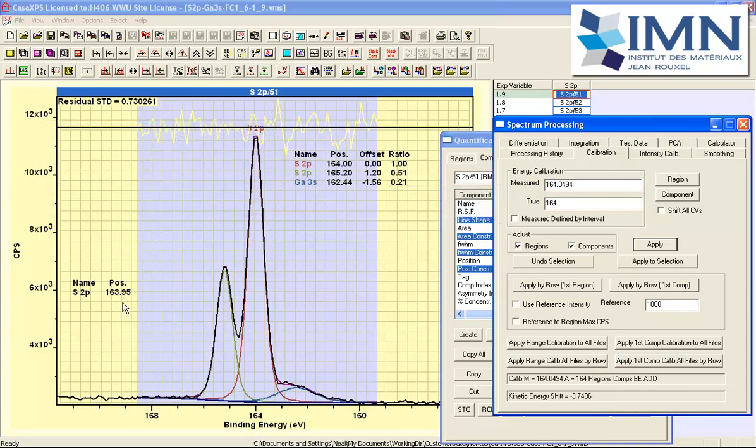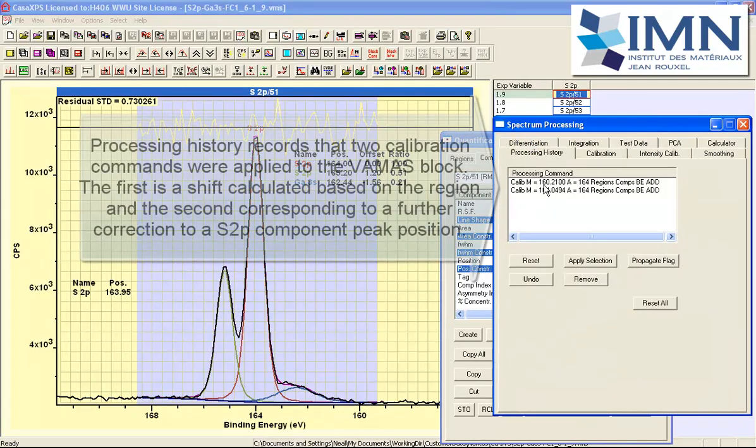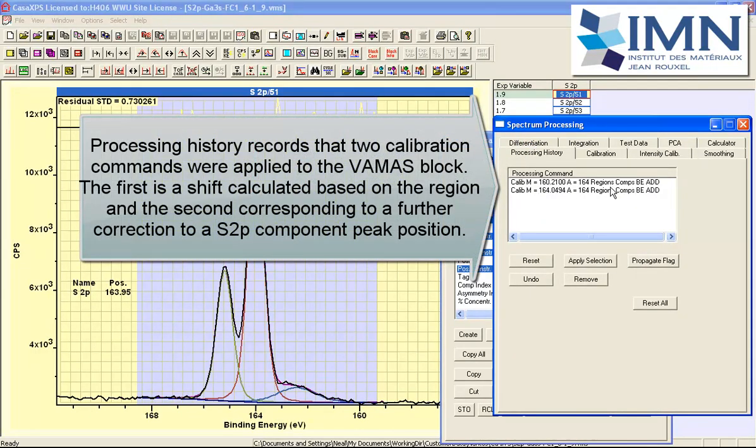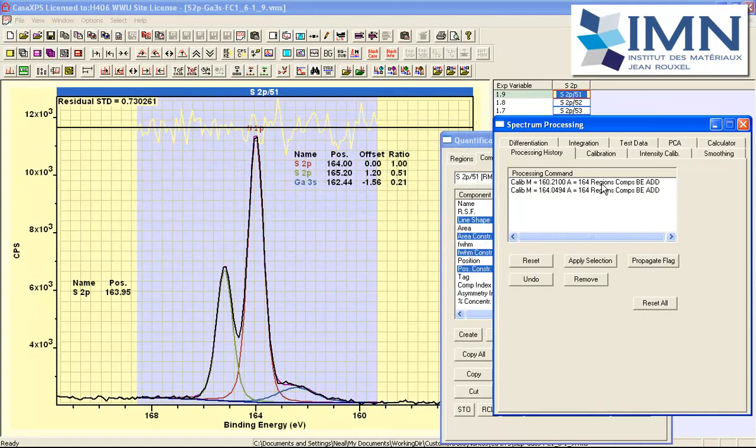So now you can see that the peak position for the S 2p three halves peak is now agreeing with the true value and as a consequence the region position has now moved by a corresponding offset between the region and the component. And if we look at the processing history you can see that there are two instructions now indicating that there was an initial calibration based on a region where we shifted regions and components and the second one was performed on the basis of the shift calculated based on these components.